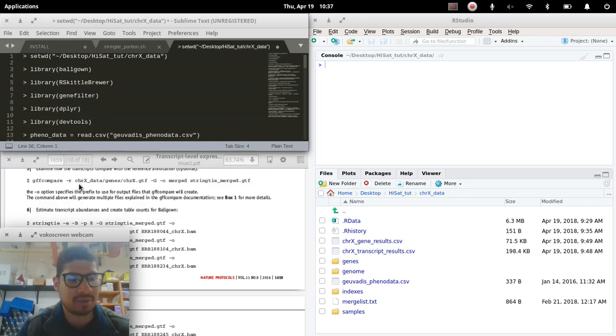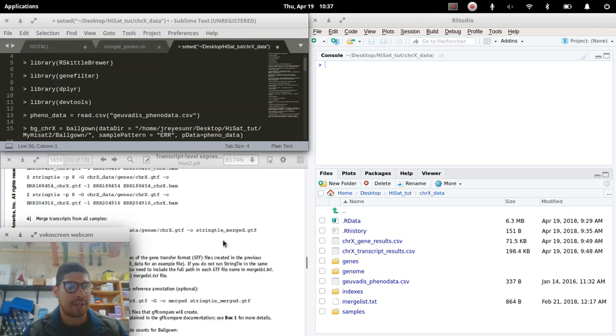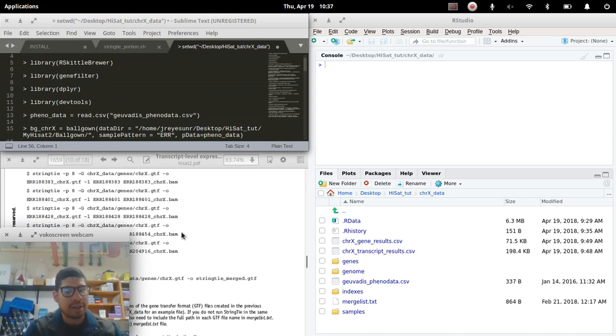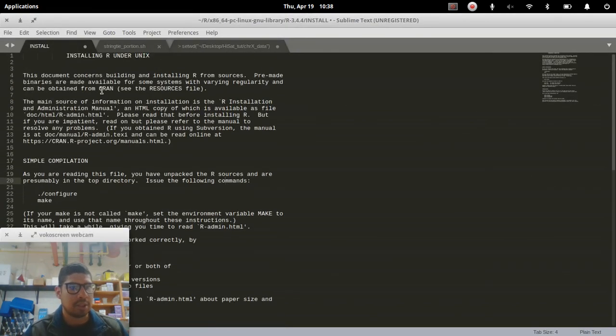Hello everyone, so I'm going to be going over the R portion of the HISAT2 tutorial today. I had a lot of issues previously because when I built my R and my RStudio, I did it through the source.